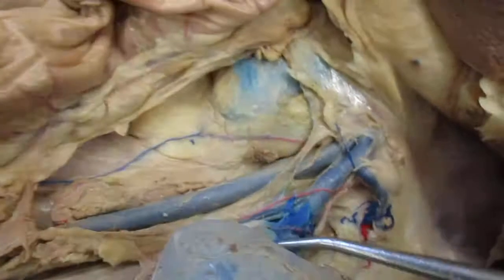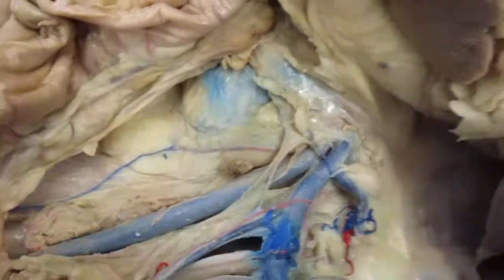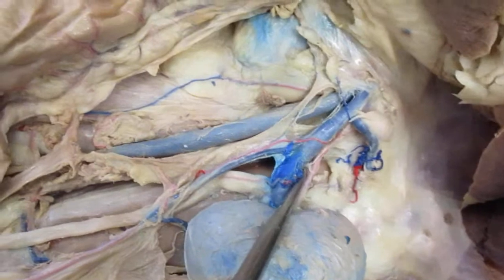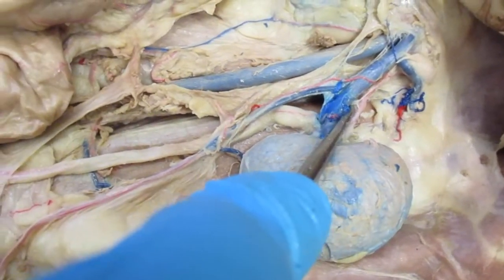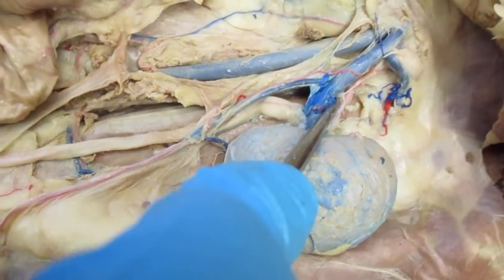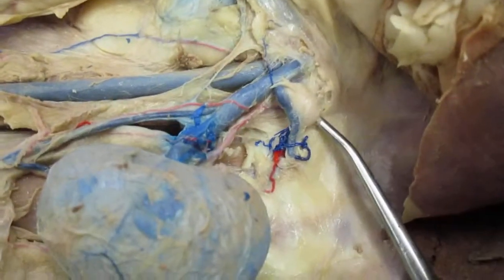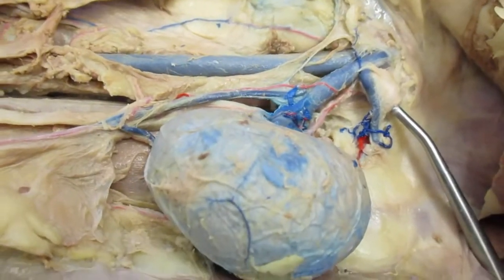So let me show that to you. So right here we can see the renal artery and renal vein. Renal artery is red, renal vein is blue. Now we can see right here, can you see that?